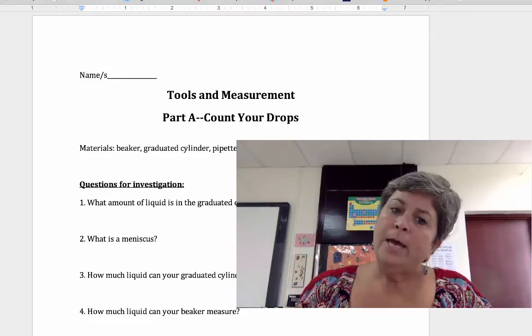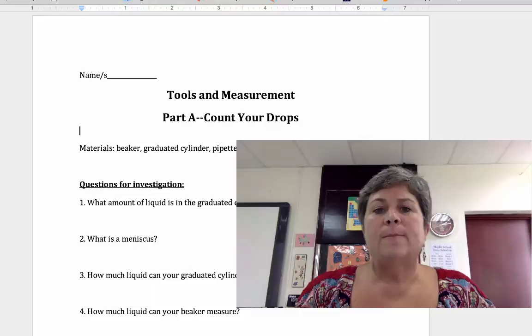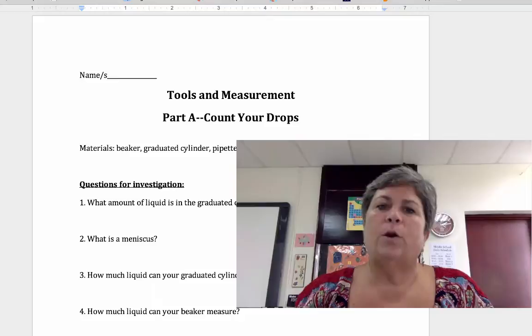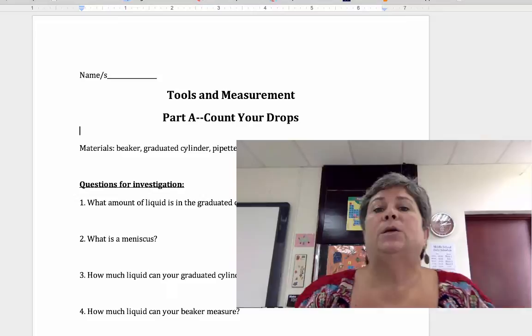The materials that you'll be using are all materials used to measure volume. Volume is the amount of space that something takes up, whether it's a liquid, a solid, or a gas. We're going to be dealing with liquids in this lab, particularly water — just tap water. We don't have to worry about it being distilled or any particular special kind.